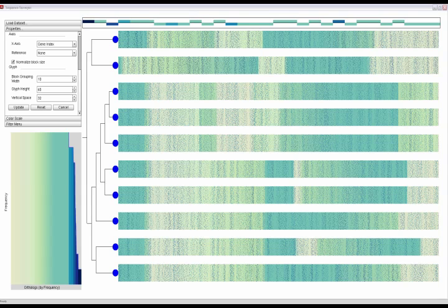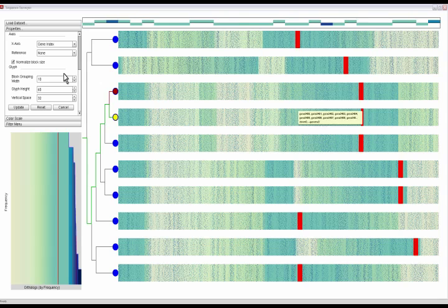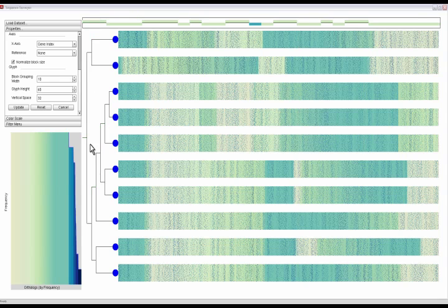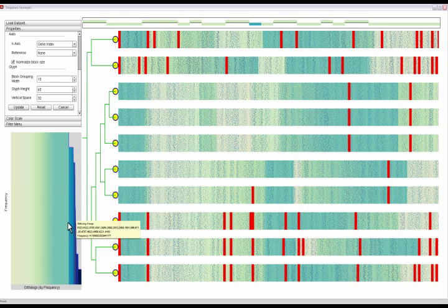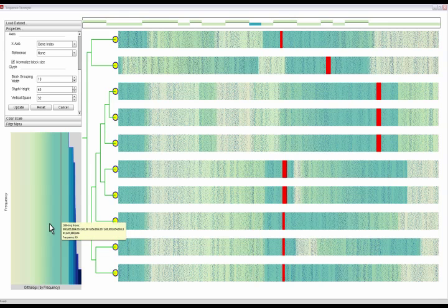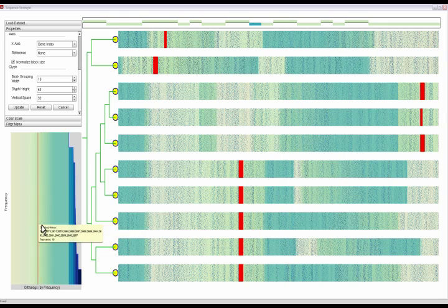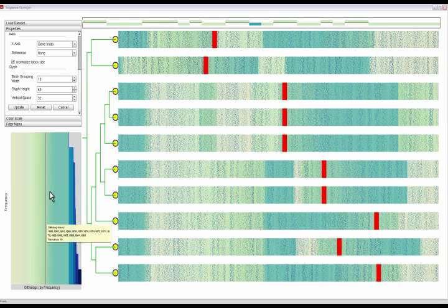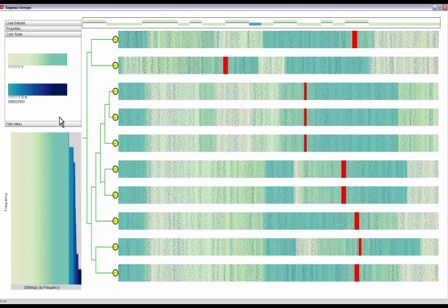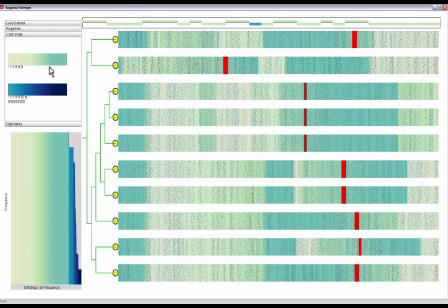The evolutionary tree associated with the genomes is displayed left in the phylogenetic tree. The histogram in the lower left conveys the overall distribution of gene frequency values in the dataset. The color mapping values are shown in the color scale window above the histogram.